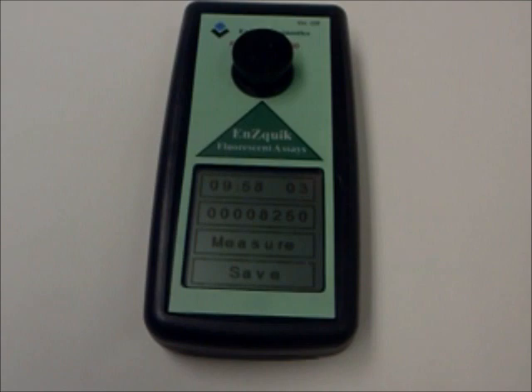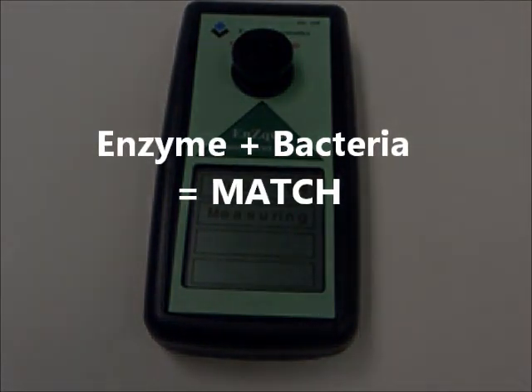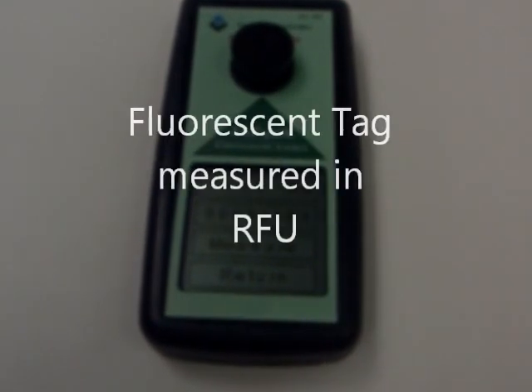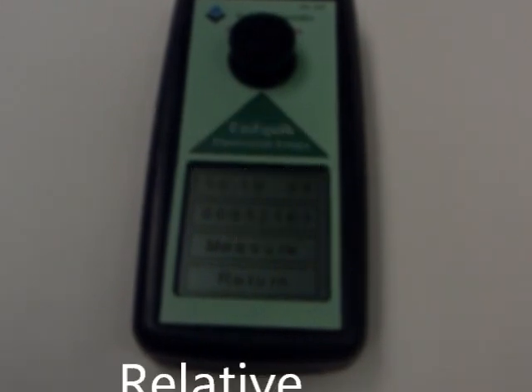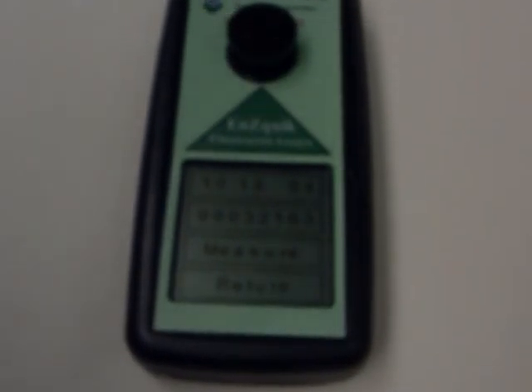If the target enzyme associated with the target bacteria is present in the sample, the substrate contained in the reagent will couple with the enzyme and a fluorescent tag is released and measured by the philometer as RFUs, or relative fluorescent units. Please note that an RFU is not a CFU.